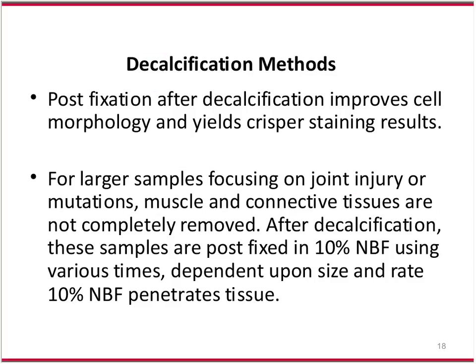And it's also relevant because we are a fee-for-service core, and sometimes the samples that come to us have already been decalcified. Somebody will say, this is fixed, it's been fixed for 3 days, we decalcified it, now we just want you to process it, embed it, and section it. Well, we only hope that what they're telling us is the honest truth, that yes, we did fix our samples for 3 days in 10% neutral buffered formalin.